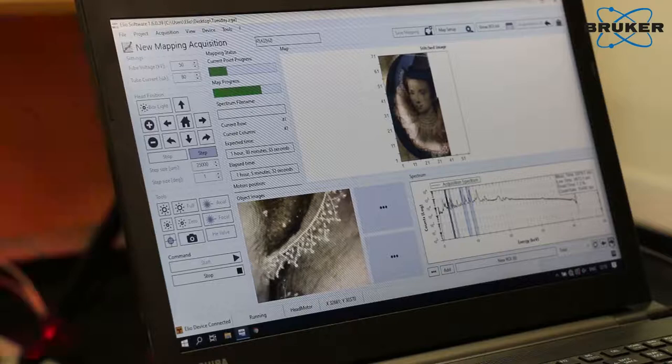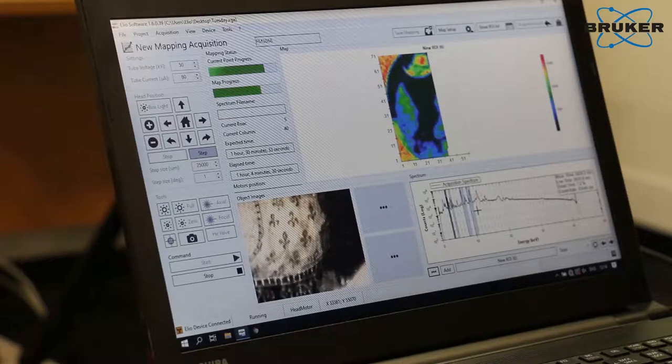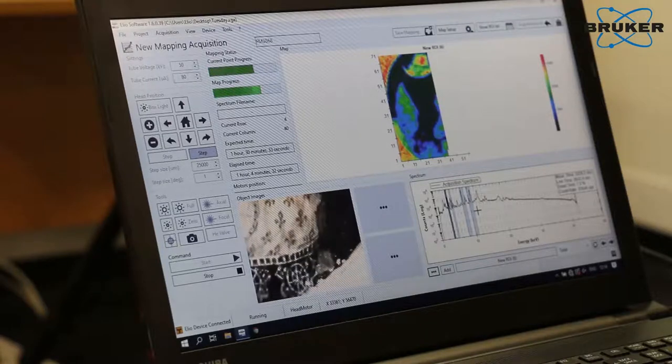That's really great because we can not only identify the elemental composition of various points in the miniature, but we can also get maps of the elements. That really helps, especially in cases like the one we're investigating now, where the original composition was slightly modified at a later time because the pigments degraded and the miniature was damaged. We have successive layers of pigments, and it's really difficult to sometimes isolate these layers without a map to guide the investigation.